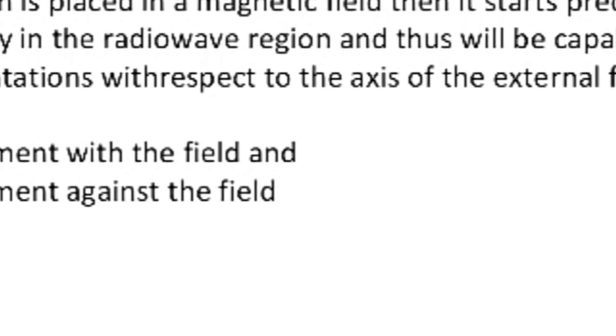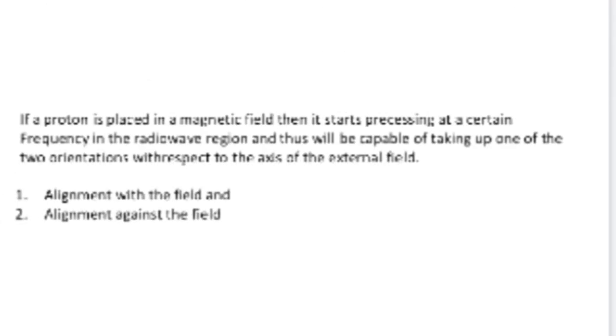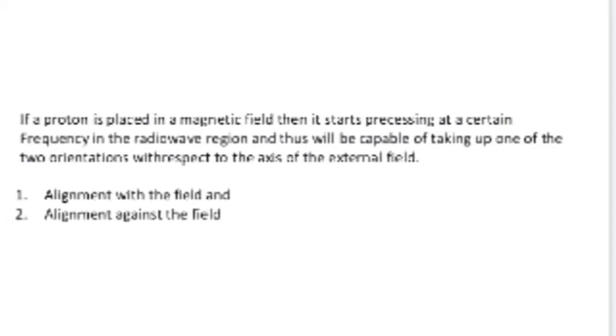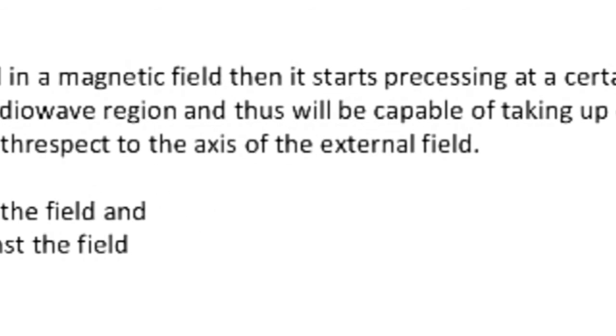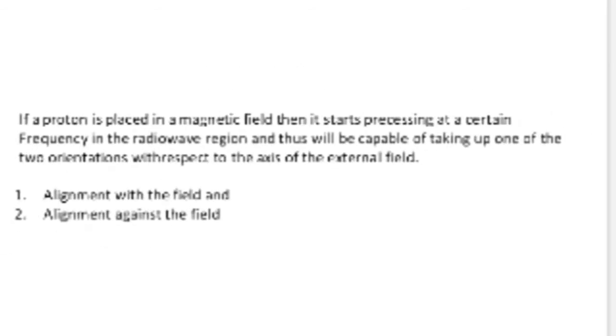Here you can see the two orientations: alignment with the field and alignment against the field.